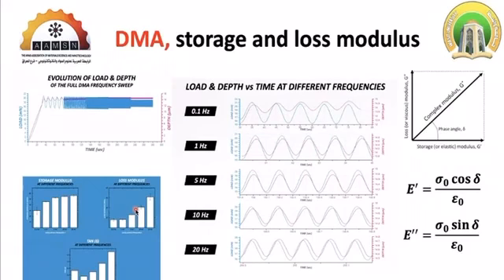They deliberately add them to a particular point of the tire to increase the storage modulus, and leave out the other parts to increase the loss modulus or the damping property of these parts of the tire. So we can again bring these industrial cases to nano indentation and test them to check if the distribution of the fibers is correct or there is a failure in it.